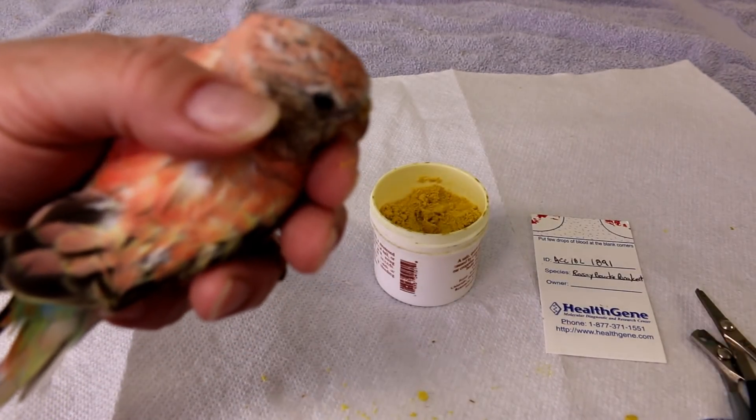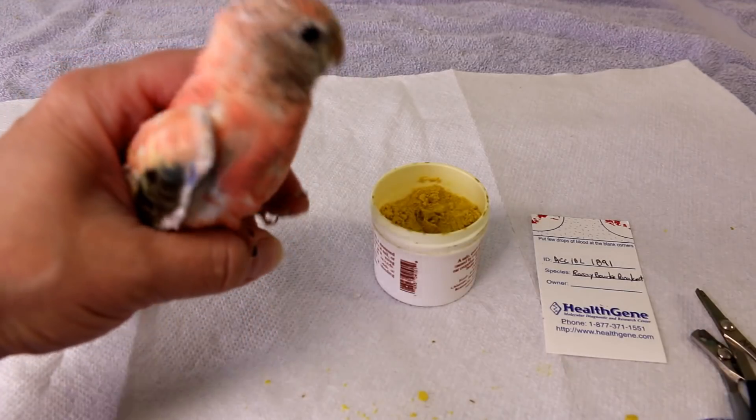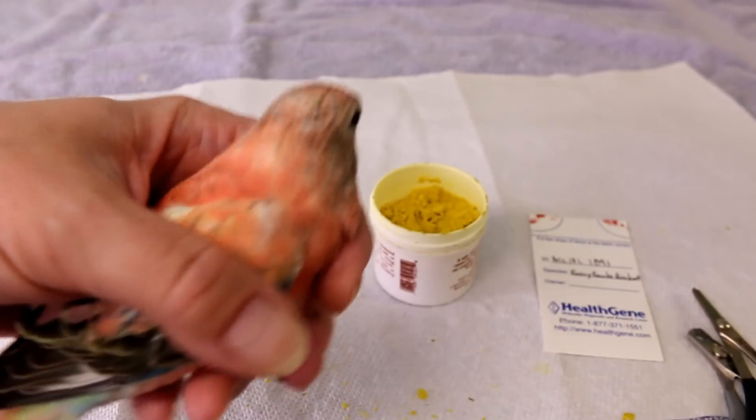I have a feeling this one is a male, so 1891 — we'll see when the results come back. You can guess too! I don't want him to fly away, so I'll put him back in the cage to rest a little bit. I think this one will be a male — we'll see.